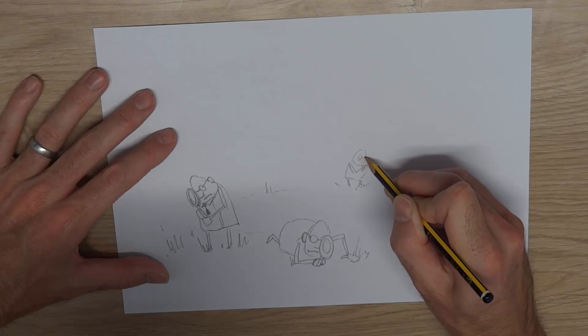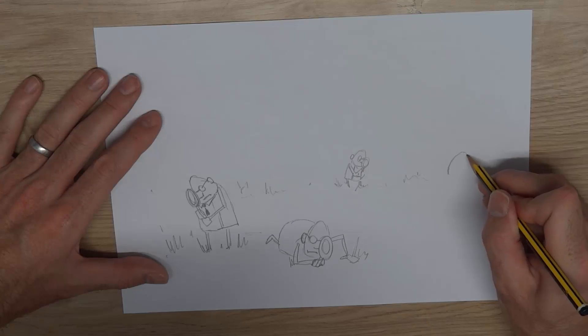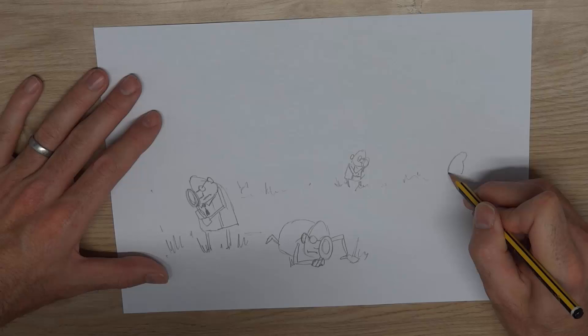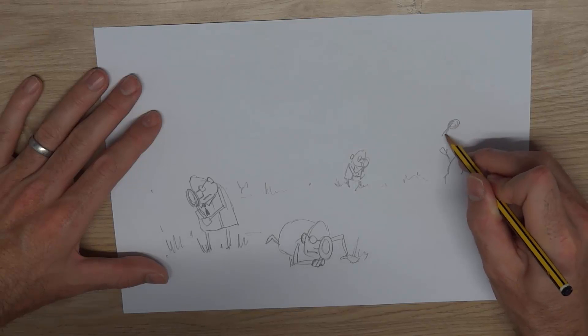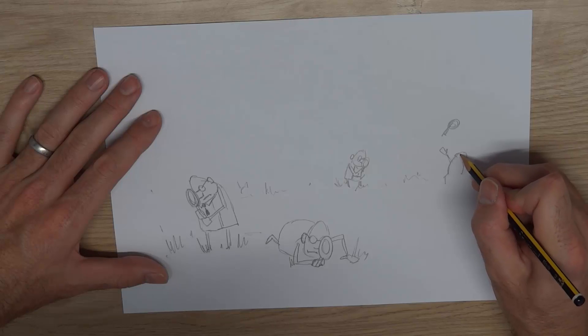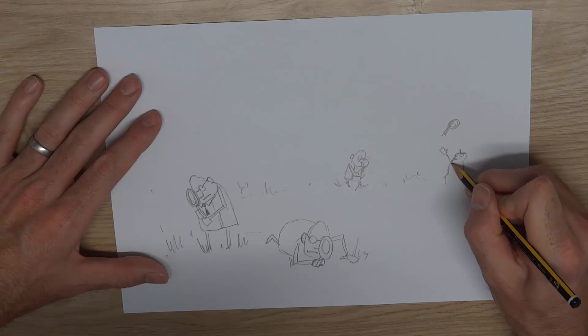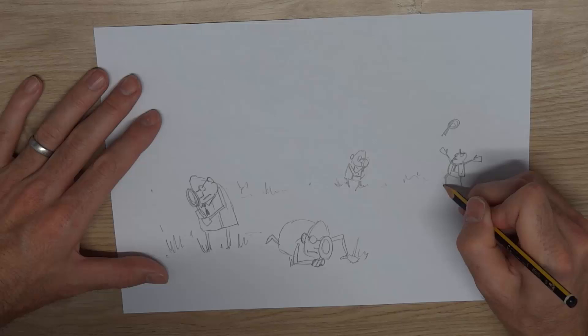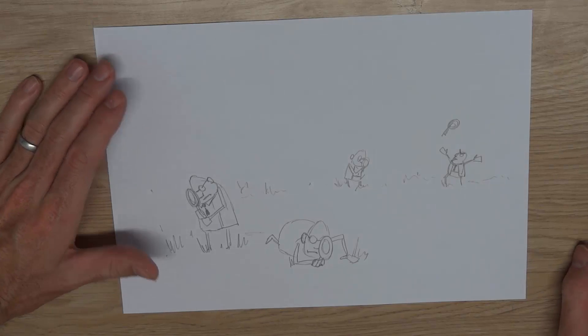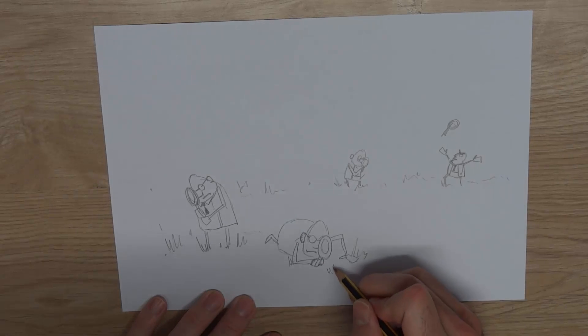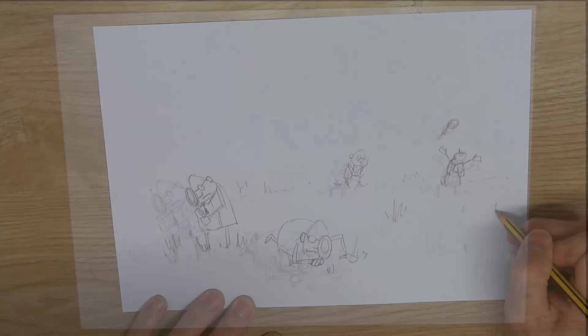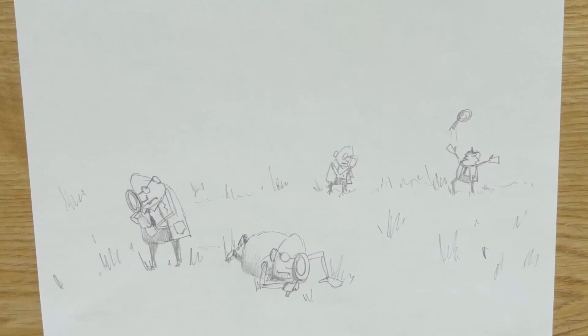When you've found that area of interest on the light microscope, how do you go about finding that same spot back again in the electron microscope? One way is to use finder grids. These are similar to standard 3mm diameter electron microscopy grids but with letters and numbers down the edges of the grid. There has been some success using software to map the grid on the light microscope and then to retrieve these coordinates on the electron microscope to find that same area of interest.